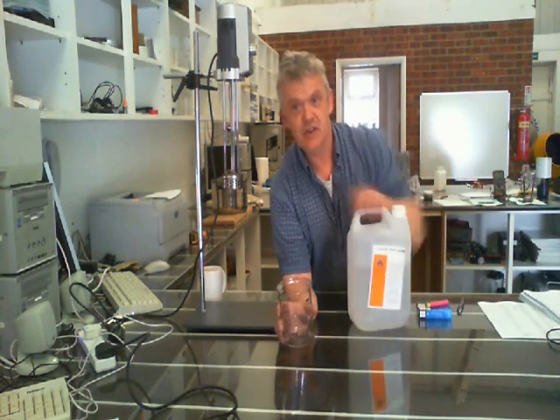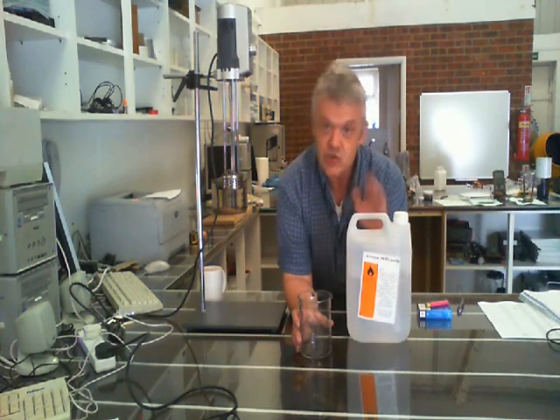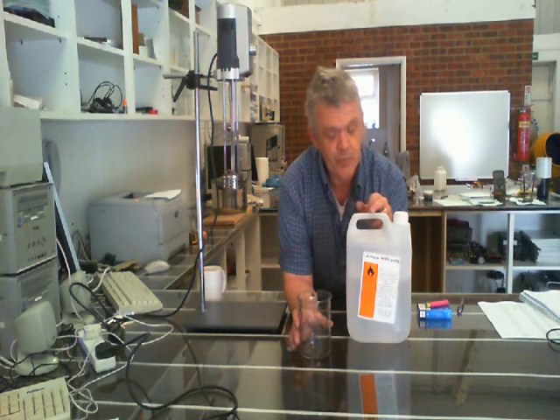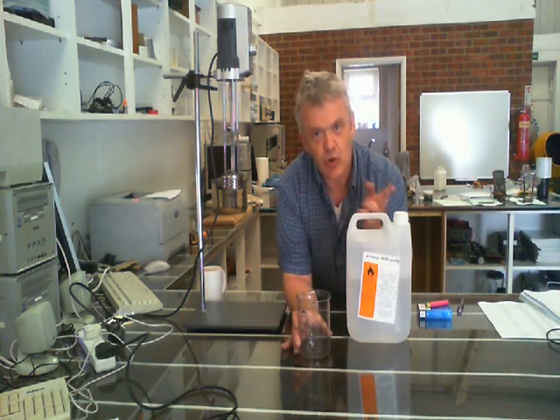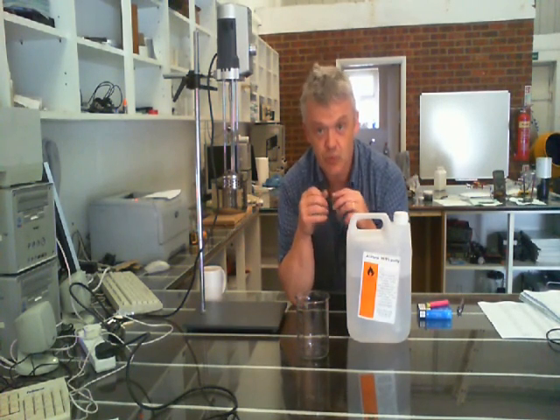This one works extraordinarily well and uses acetone. If you put graphene in straight acetone, oddly enough, not very much will happen. If you put graphene in water, again, oddly enough, not very much will happen. But if you mix the two, you get a co-solvent which has very different properties. Once you get those mixed proportions right, the graphene will actually dissolve and stay in suspension in the right mix of acetone to water.